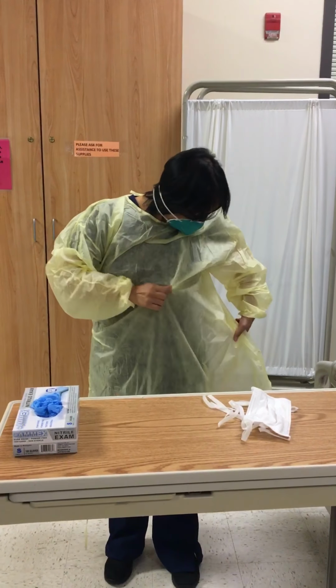After the gown, you put on the gloves. Make sure the gloves go over the cuffs of the gown for more protection.